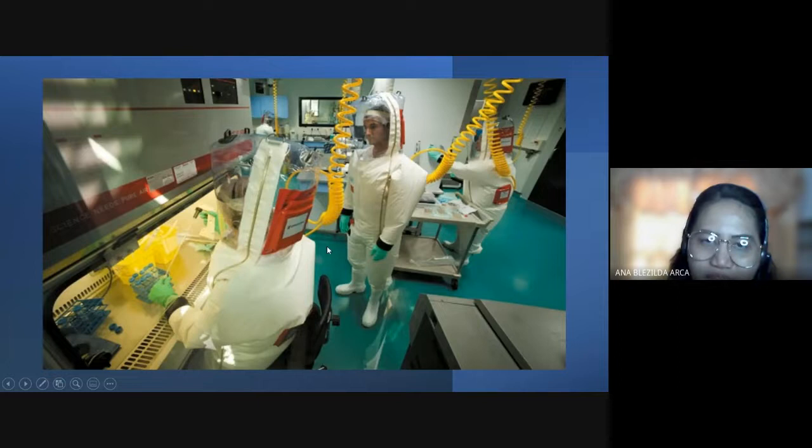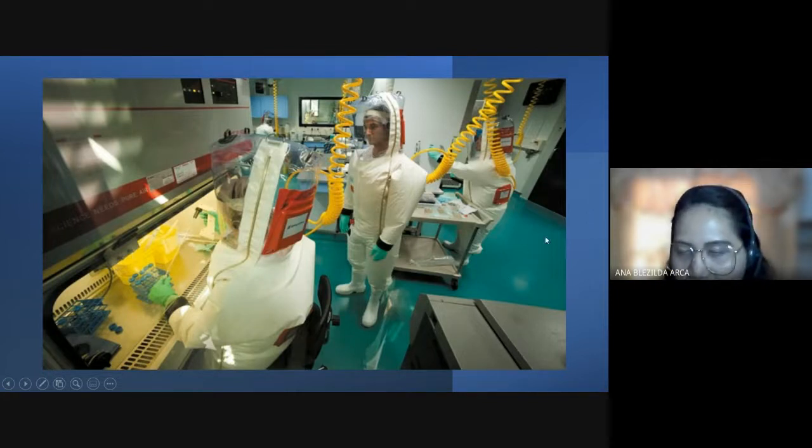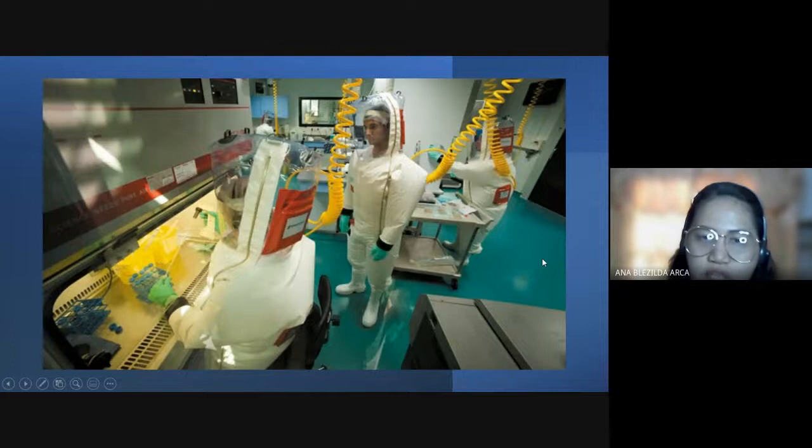Okay? Hindi siya basta-basta hihinga doon sa laboratory. So yung hangin niya, may source of air. Kasi class, dito sa kwarto na yan, wala talagang hangin dyan. This is the negative pressure. Negative pressure room yan. No air inside the lab. That's why yung source lang ng kanilang oxygen is this one.